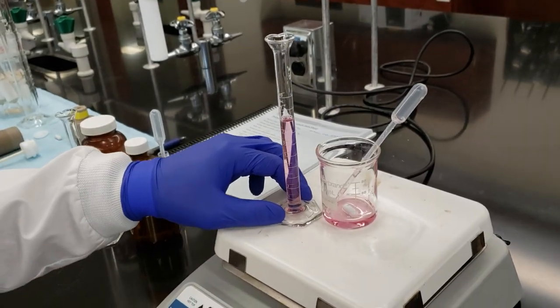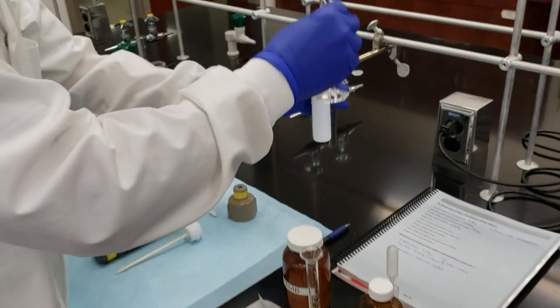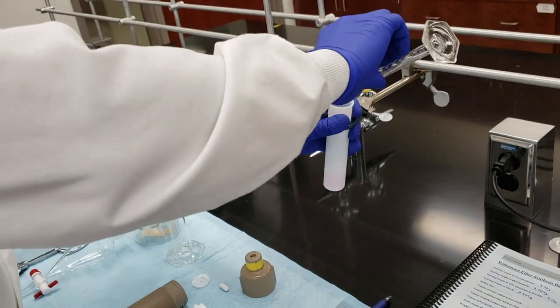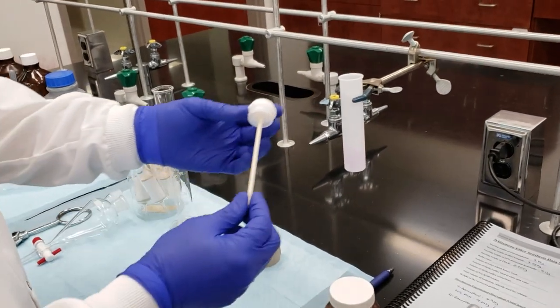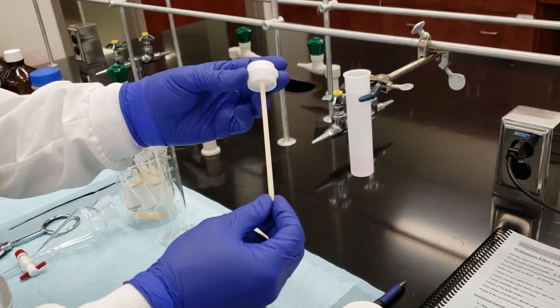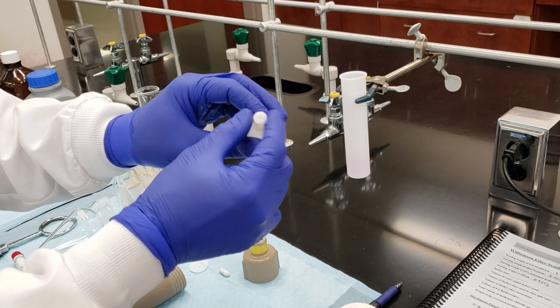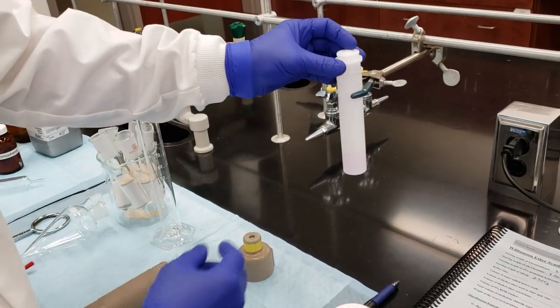All right, let's take a look. It's right at 8 milliliters. Go ahead and take this over, pour this into our reaction vessel as well. So all of our ingredients have been added. We're going to take our Teflon plug here, and this is our thermowell. Since we're only using one vessel, this is going to be our ATC vessel. We're going to place our thermocouple down inside of this thermowell so that we can monitor the temperature of the reaction. So we'll go ahead and put this in place.